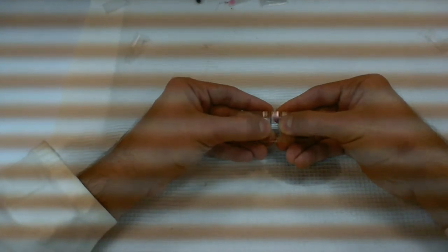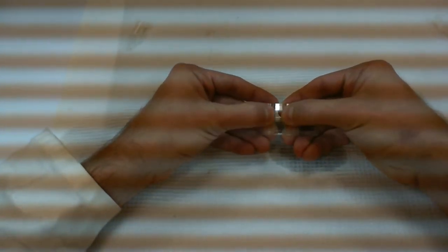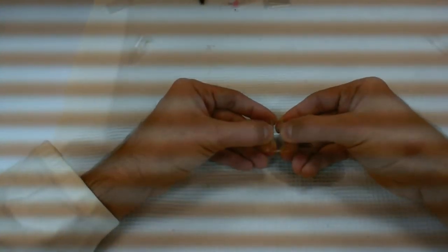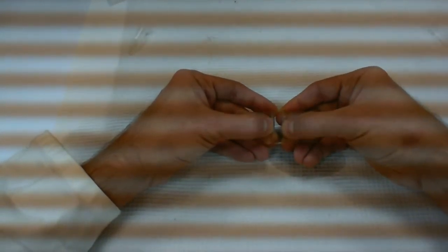What we're trying to do is replicate this effect when you have two sheets of glass, for example two microscope slides that are stuck together. There was a bit of moisture between them initially, and no dust between them. So again, it's very important that you have a clean cover slip, so wash it with some water first and then with some ethanol, and wipe it down carefully and gently. Don't break the cover slip. Those break very easily.